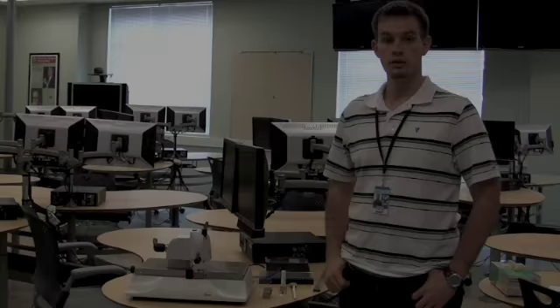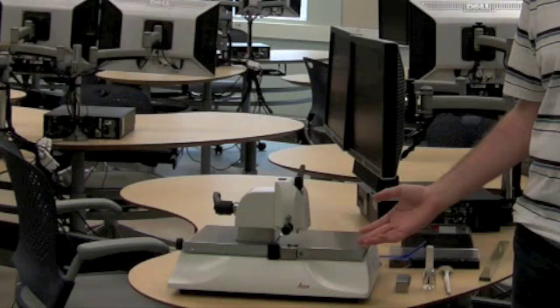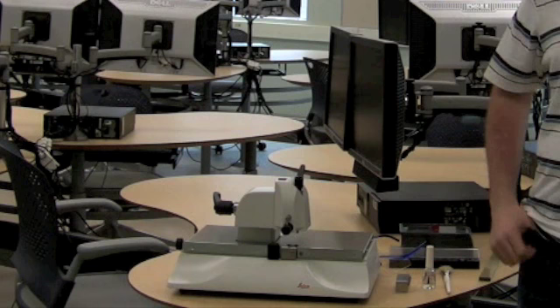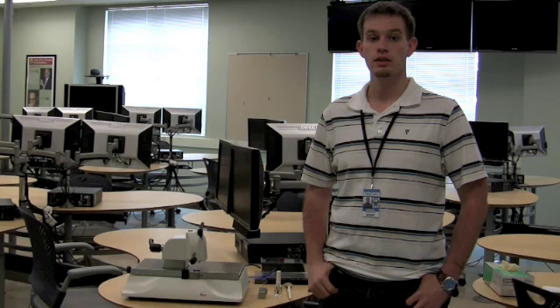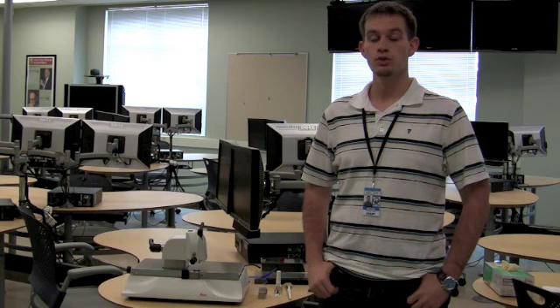This is the Leica EM KMR2 glass knife maker. Using this instrument, we will be able to take a 400 millimeter long glass strip and break it into 25 millimeter glass knives. Before using this or any other equipment in the lab, be sure to read the safety sheet and always make sure to use good lab practices.